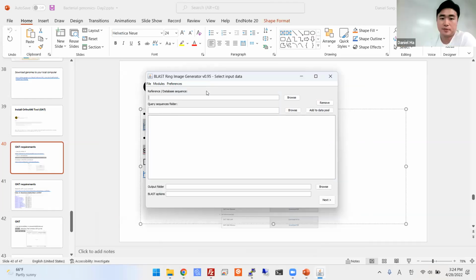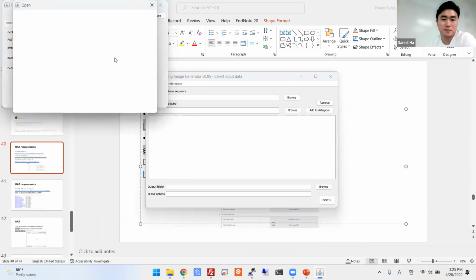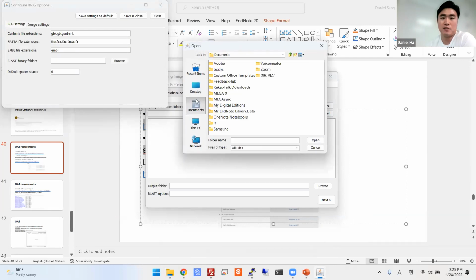All right, guys. So sorry. So now we can add our stuff in. First, you need to add your BLAST path. So we downloaded it yesterday. Sorry, Jess, you also need to download this too.